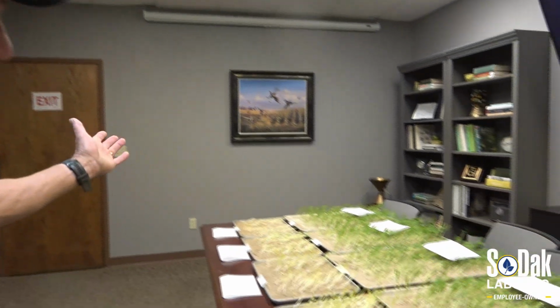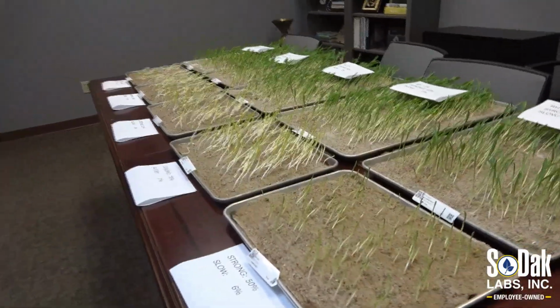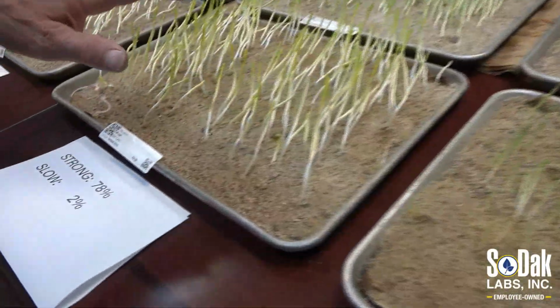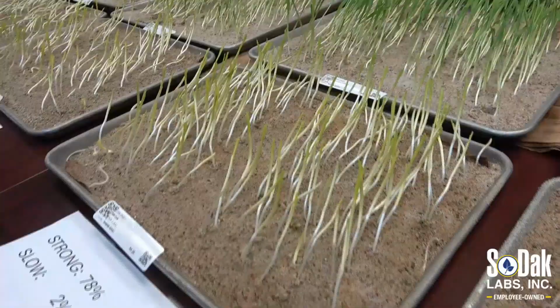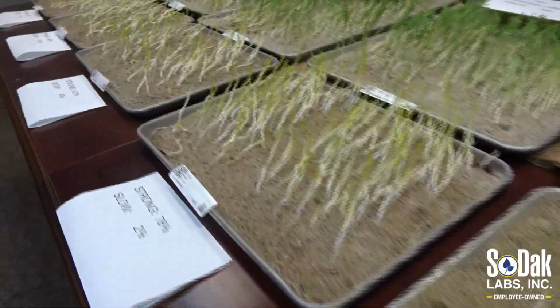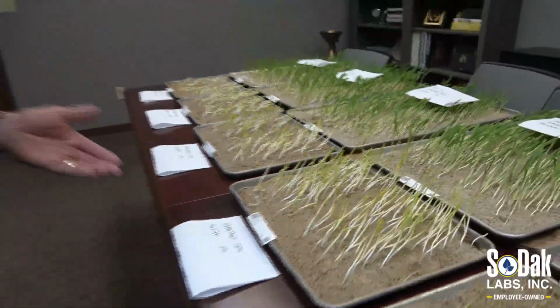When you take an overview here of this, there's sort of a wow effect on these 5 lots. It's clear that this lot is responding the best to the cold test. And the other 4, not quite as well, for sure. So we'll talk about these a little bit.